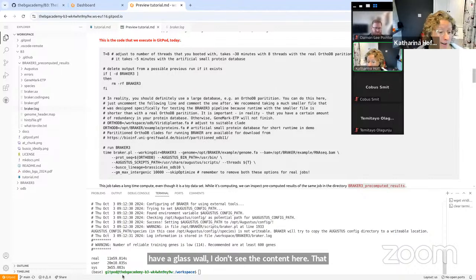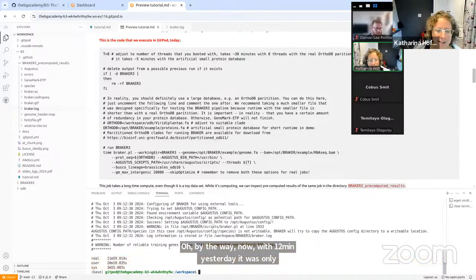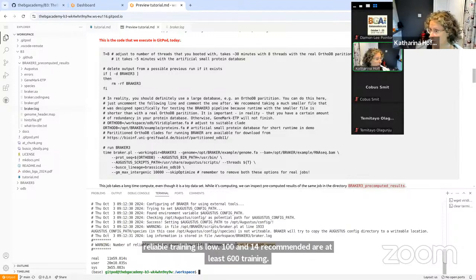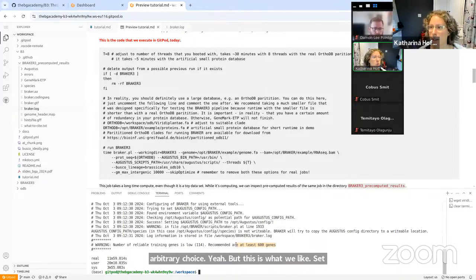Oh, by the way, now with 12 minutes, yesterday it was only 9, my job finished. As you see, I get a warning message. It says number of reliable training genes is low, 114. Recommended are at least 600 training genes. The 600, we discussed that before, is a bit of an arbitrary choice. But this is why we set BRAKER to actually issue a warning. If you have more, it will be better.